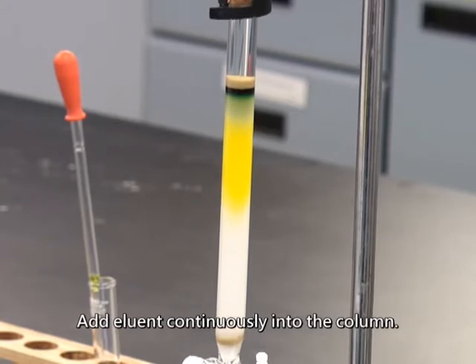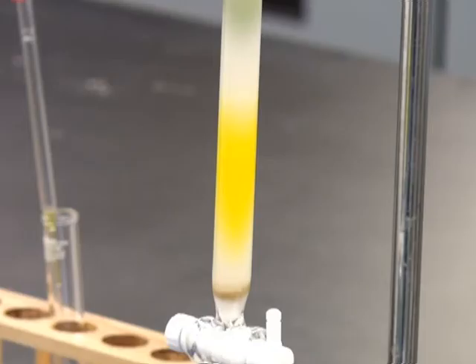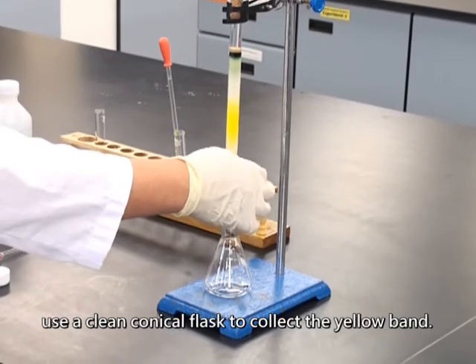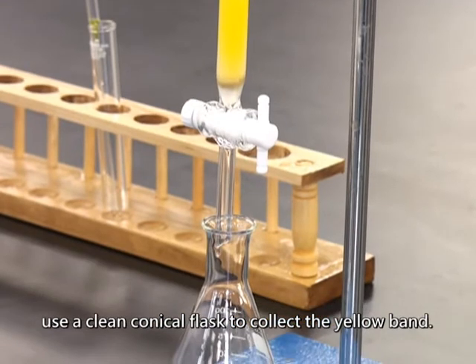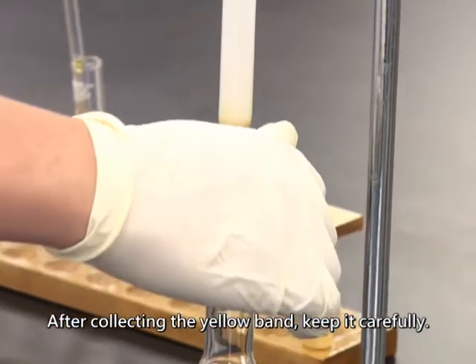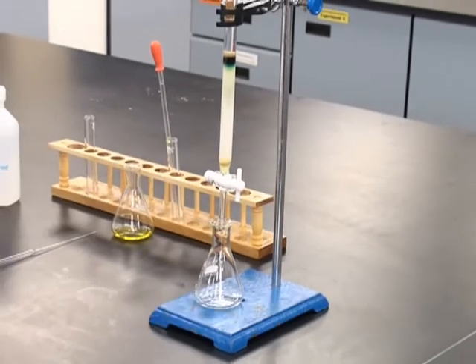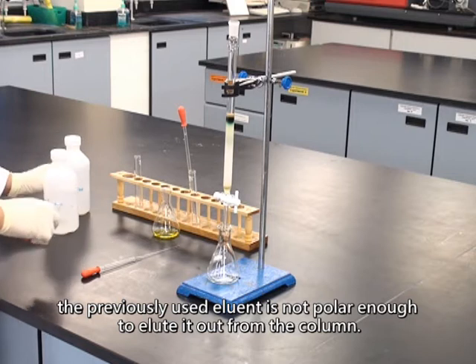Add eluent continuously into the column. Never let the surface of the silica gel dry out. When the yellow band almost reaches the bottom of the column, use a clean conical flask to collect the yellow band. After collecting the yellow band, keep it carefully. Use another conical flask to collect the solution coming out from the column. As chlorophyll is a polar substance, the previously used eluent is not polar enough to elute it out from the column.